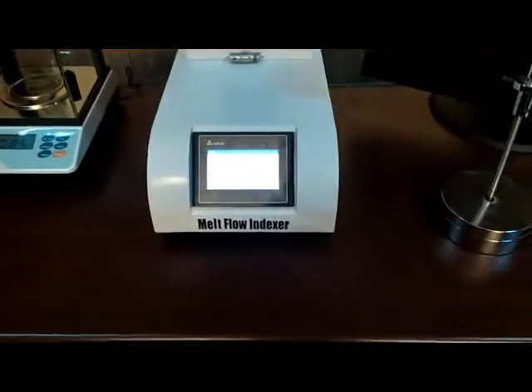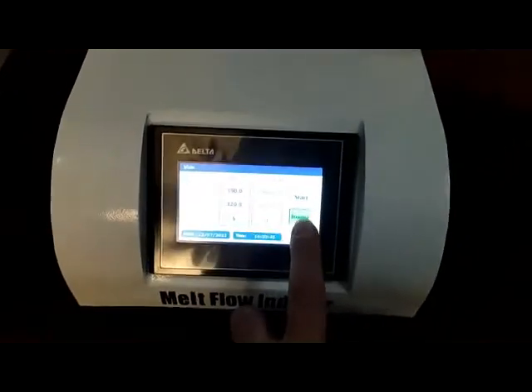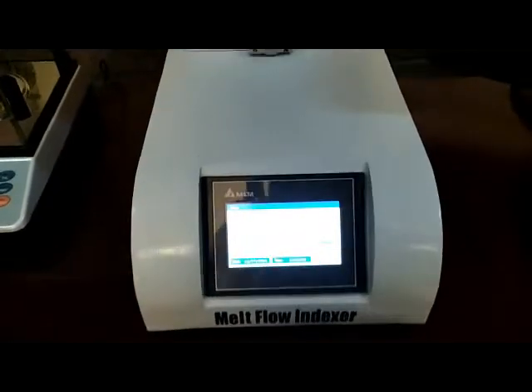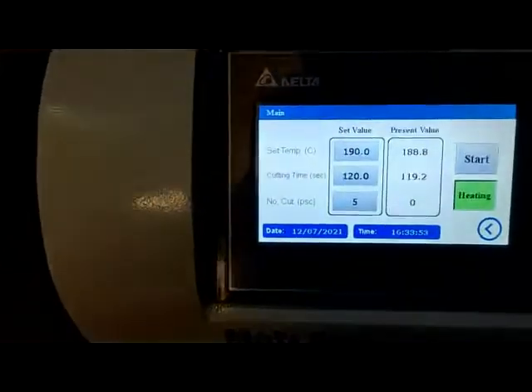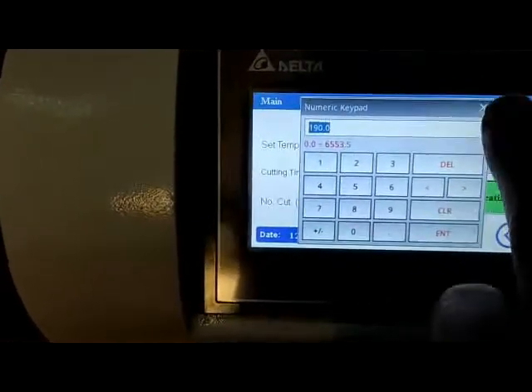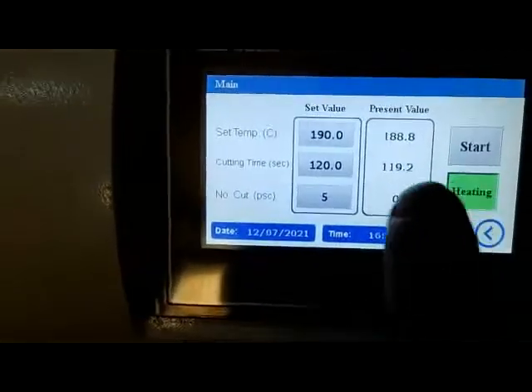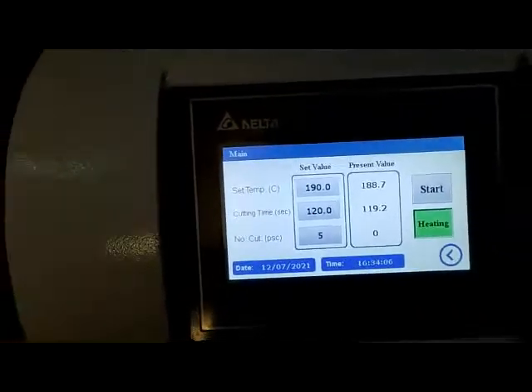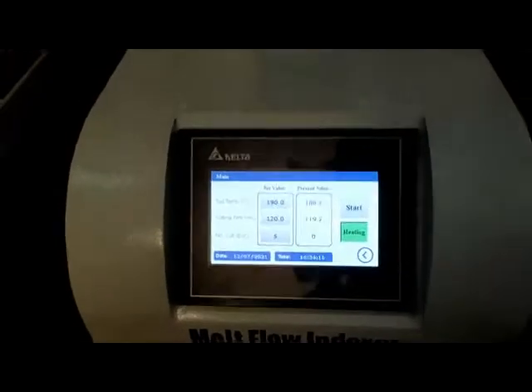and also an automatic cutter. First of all, for starting the test you need to turn on the heater and wait until the temperature is raised to the set value. In this menu you can set the temperature. Here you see the present value and the set value, and you wait for them to be the same.